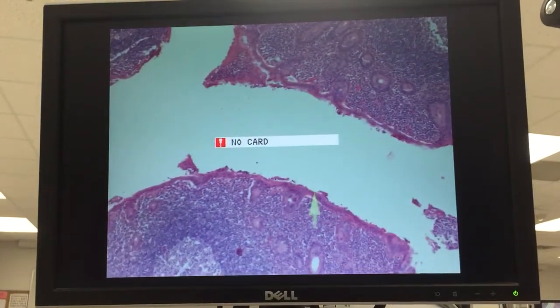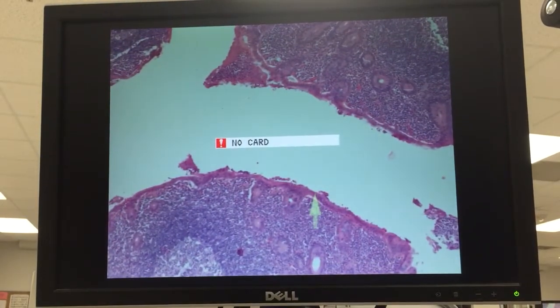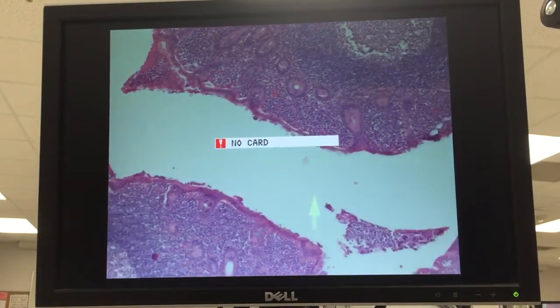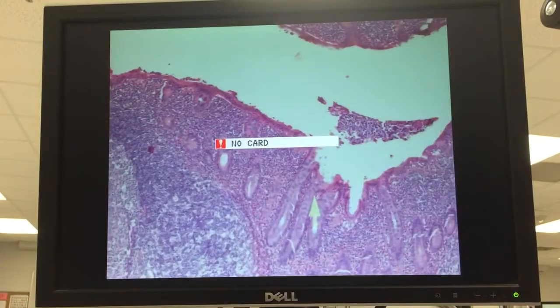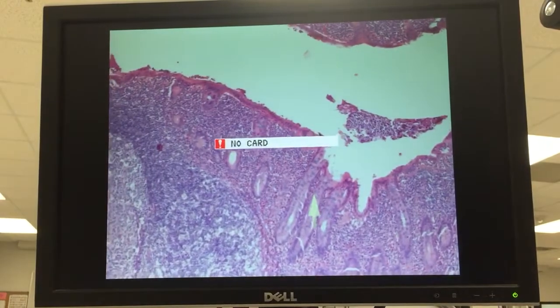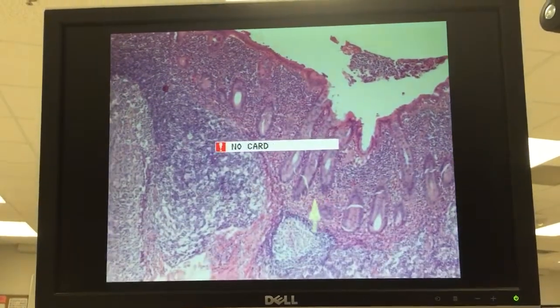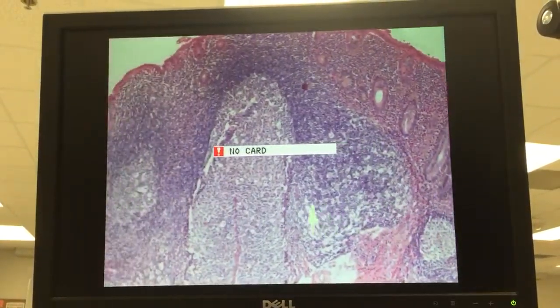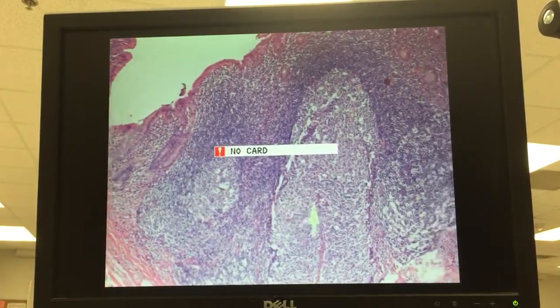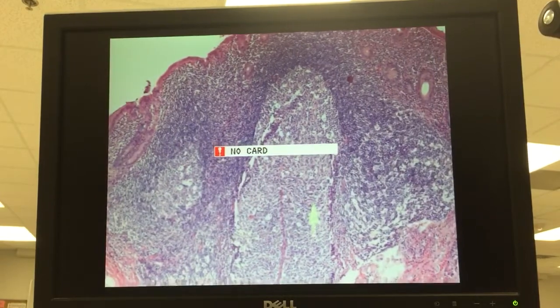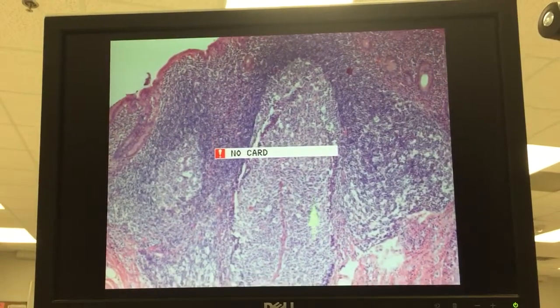This is a simple columnar epithelium. We have crypts of Lieberkühn, lots of goblet cells, and lots of lymphatic nodules. In this case with germinal cells.